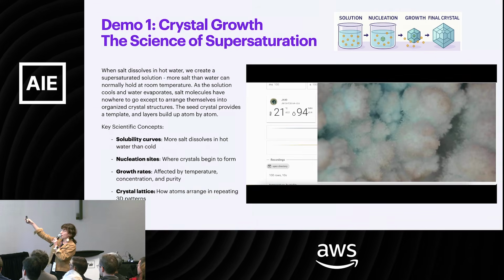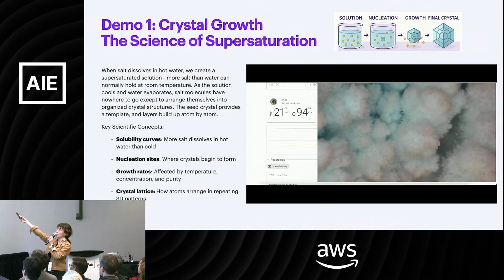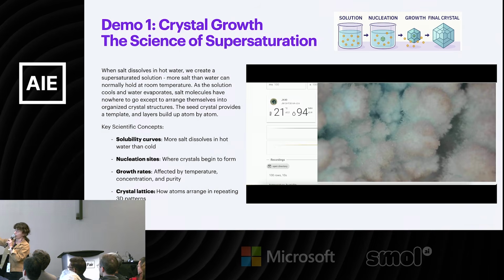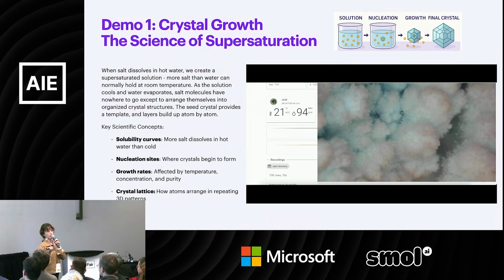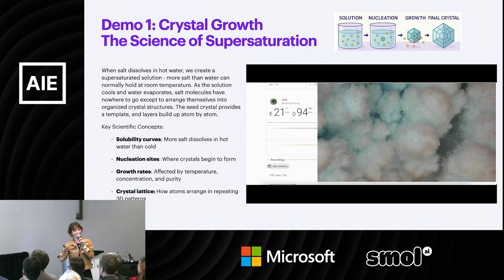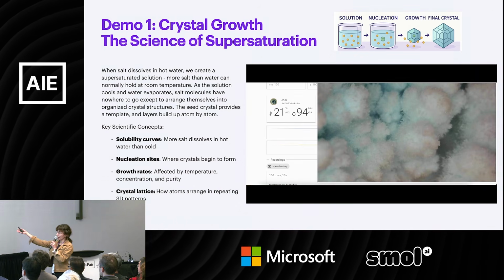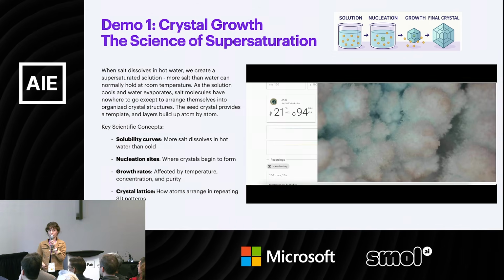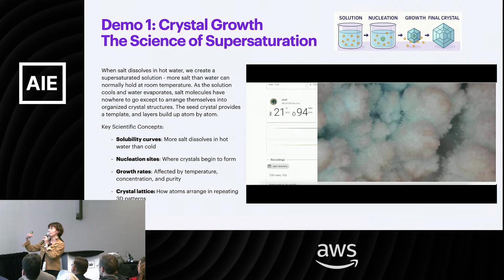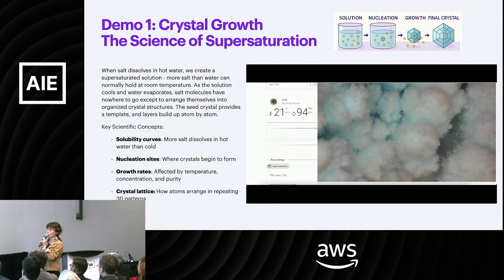That creates this process of nucleation and the growth of crystals. The trick in having beautiful crystals is how you do the cooling off. It needs to be gradual. You need to not move the liquid or the object. So the gradual cooling and the level of humidity is what gives you beautiful crystal formation.